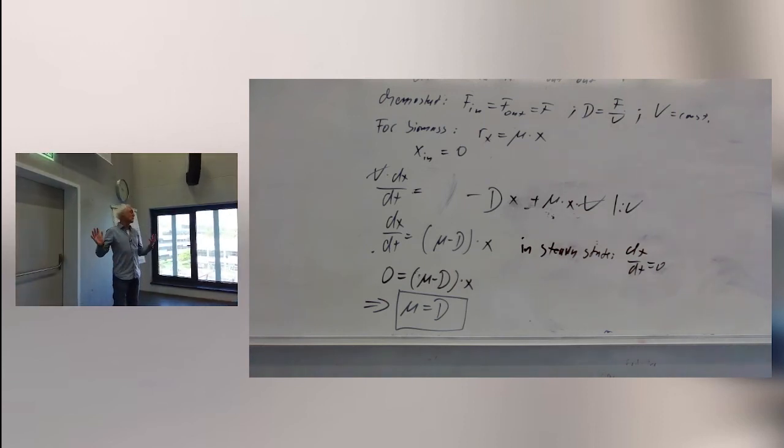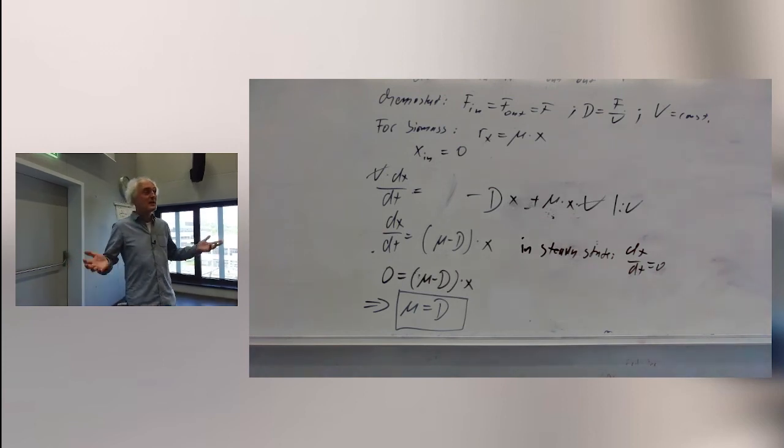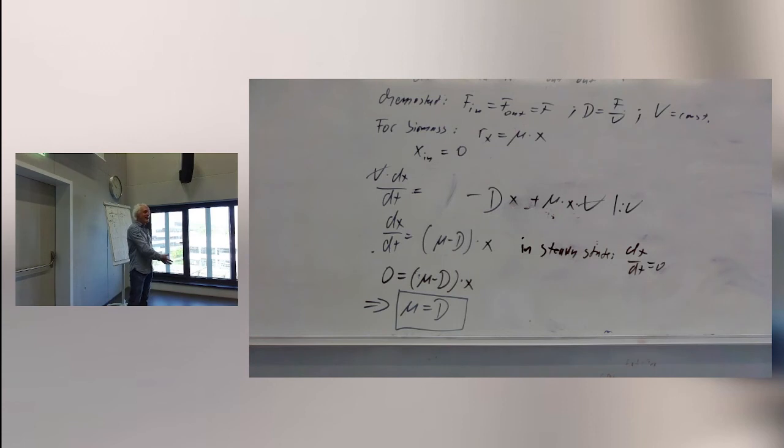So this is really cool, that we can set a biological parameter by setting a technical parameter. And this is what you will also do in your lab course. You will set up your chemostat and run it. You start, of course, with an unsteady state. The bacteria, or the yeast, need time to find their steady state. This usually takes 2 or 3 reactor volumes, so it takes overnight. And on the next day, hopefully, we have achieved a steady state. And then you will measure that. And then, of course, we will change the dilution rates.